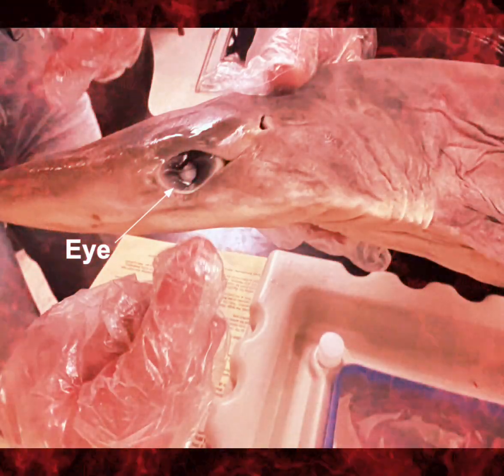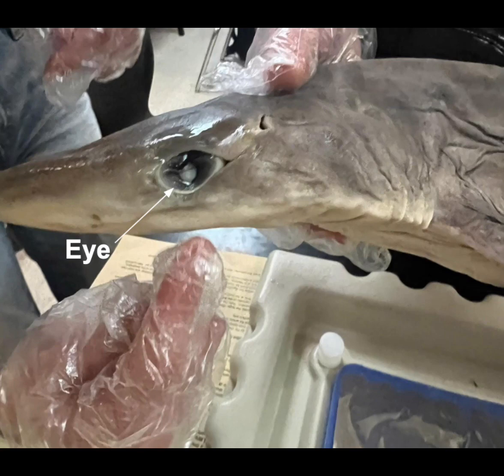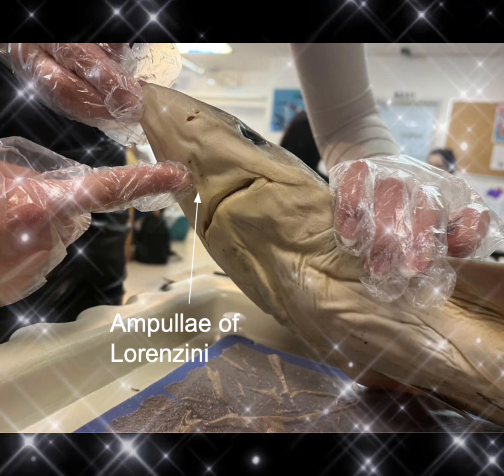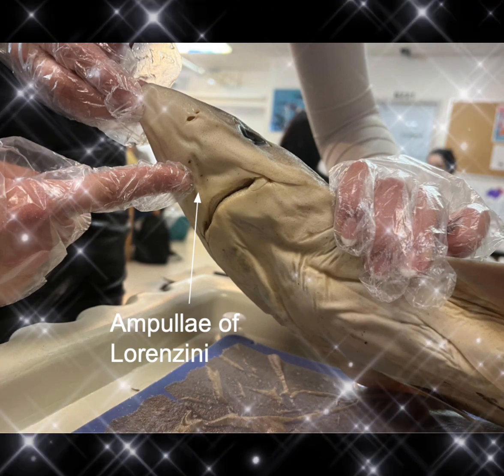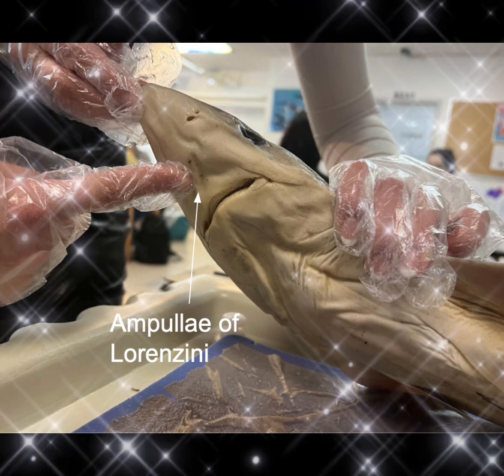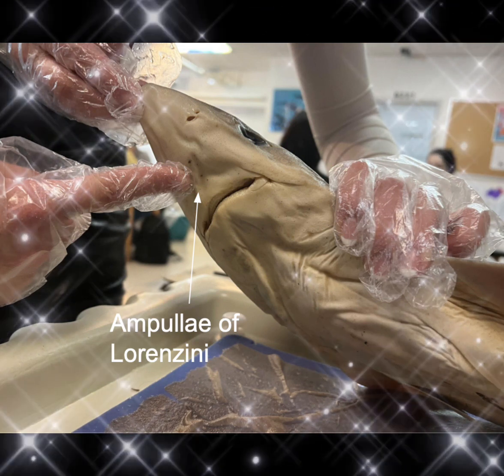The eye is very similar to that of a human. They have a transparent cornea that protects the eye, and a darkly pigmented iris below the cornea that contains the pupil. The lower eyelid contains the nictitating membrane that protects the cornea by covering the surface of the eye. The ampullae of Lorenzini are a collection of black-looking pores located on the rostrum around the eyes, snout, and nostrils. They have the ability to sense electric fields through the gel contained within them.